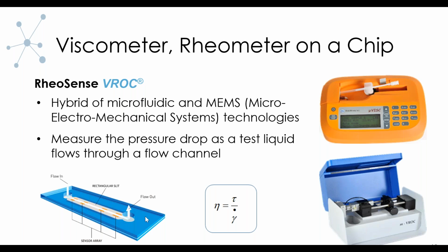We can control shear rate by use of a positive displacement pump, and we know the exact dimensions of the flow field. With those two parameters, we have shear rate. So we can calculate true or absolute viscosity by measuring the pressure drop, which is proportional to shear stress, divided by shear rate.